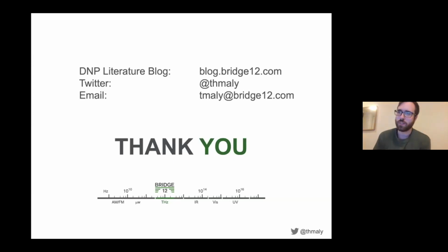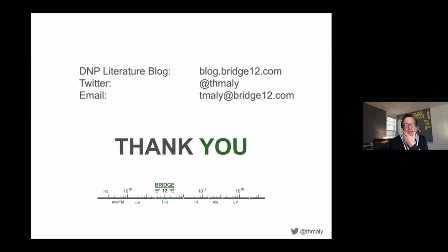Thierry Broca mentioned, thank you for the talk, and that you had mentioned the 3D printed waveguide. Do you see this being used in the probe, maybe in a horn shape to focus the beam on the sample to then improve the B1 field? I think there needs to be a little bit more research in the type of material that you use. I can tell you that is the gray resin from the Formlabs printer. I think the community needs to play around a little bit more with the resins to optimize this. But yes, horns, all sorts of shapes to get into awkward places in your probe. I think that is exactly where this will be going.